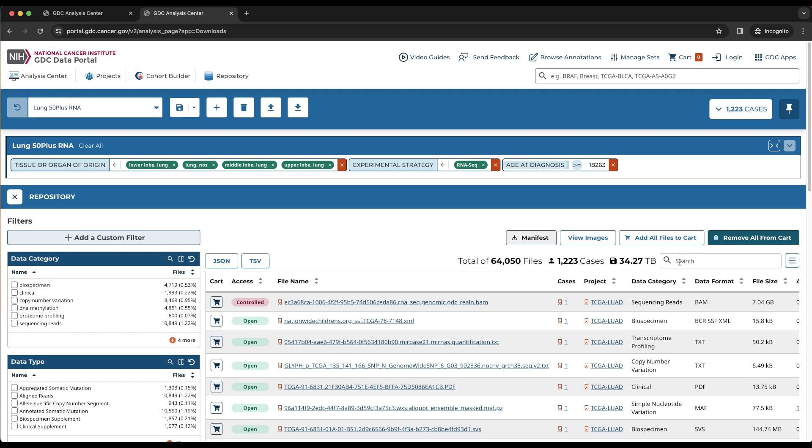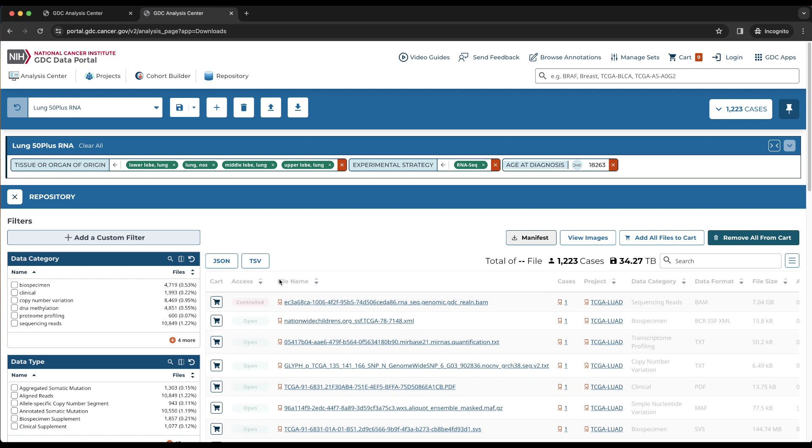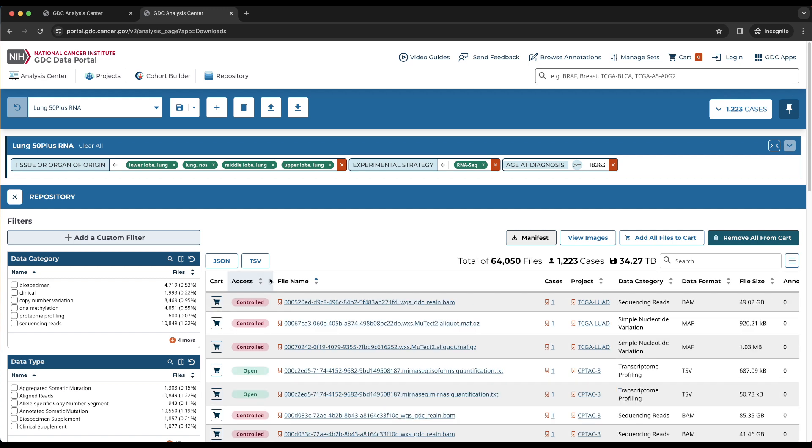In the table header, the table can be sorted by choosing the up or down arrow next to the column names. The table columns have some basic properties that describe each file, including access, which tells us if a file is open access or controlled, which requires dbGaP permission.